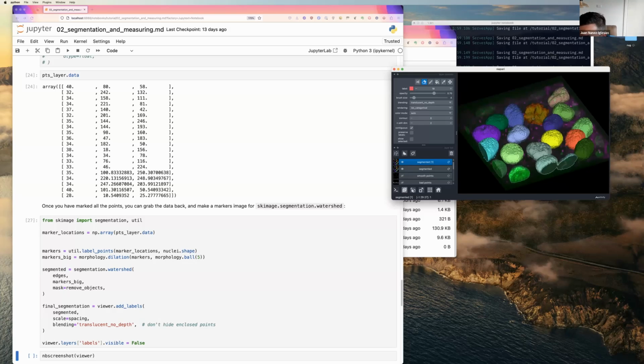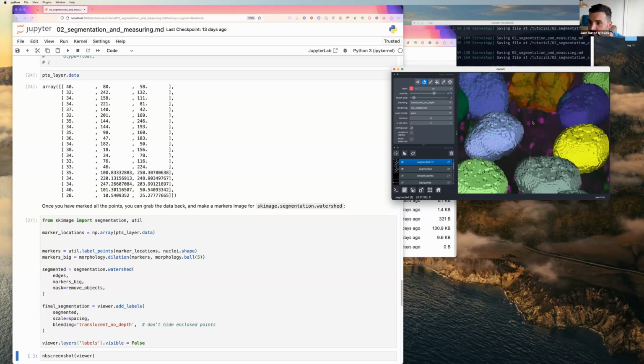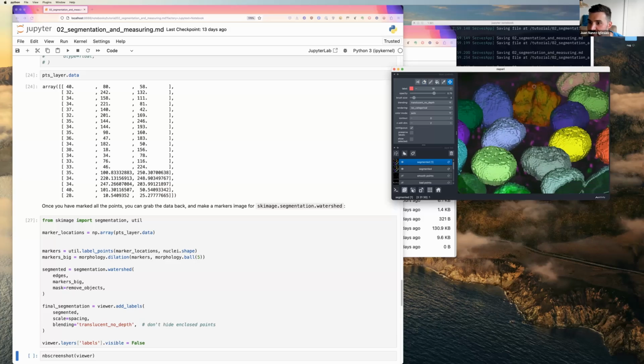Is it doing anything? It should be. I think I can see changes. Oh, come on. Everything is broken in this world. It's doing something.